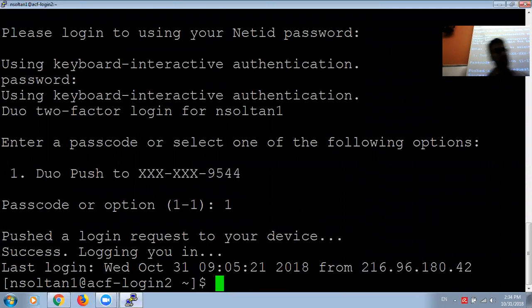And then I quickly go to the section that we finished last week with the count reads that you did and sent as a qsub through ACF, and you may have gotten a text file containing the read counts of a BAM file, which was only from one BAM file. But for the differential expression analysis for today, we need 16 files, and I've already analyzed them. The results are exactly the rest. You already have one text file, and then I added those 15 files. It's in the directory in the course website.